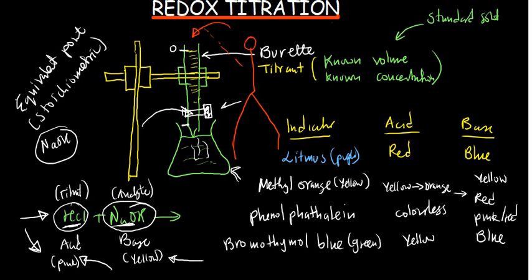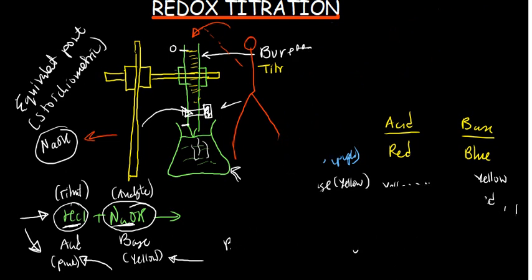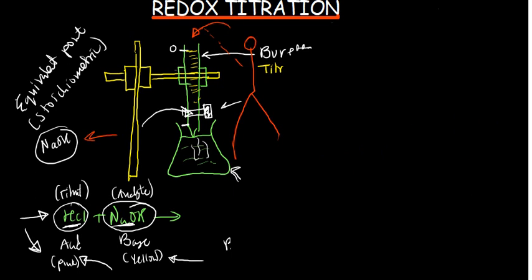And again, when you are smelling things that you are dealing with, for example sodium hydroxide or hydrochloric acid, don't put your nose on the container that contains these substances. They can destroy your nose. Okay? So how do you then smell things in a lab?